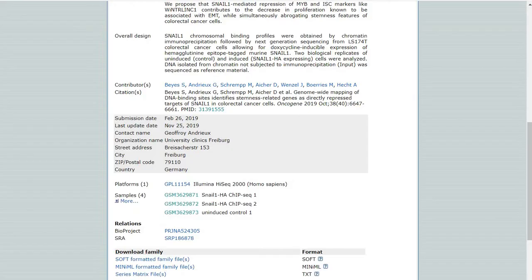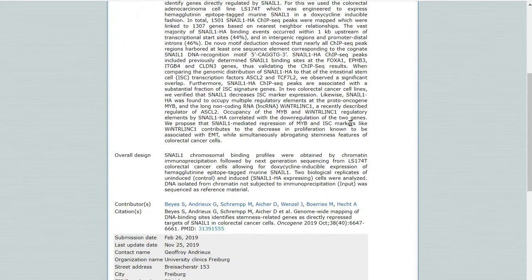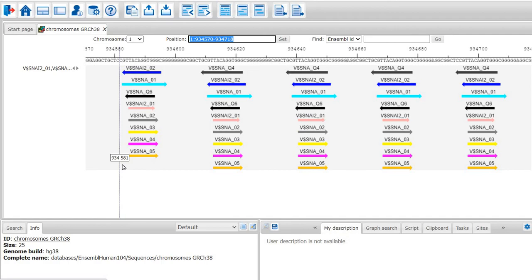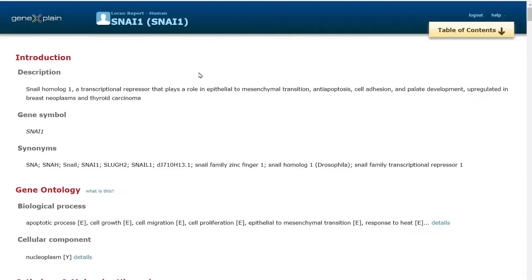Hello everyone. In the last part, we performed CHIPSEC data analysis of the publicly available dataset GSE127183. Bed samples were treated to induce the expression of Snail 1 transcription factor and we saw the identification of enriched transcription factor binding sites in the peaks.